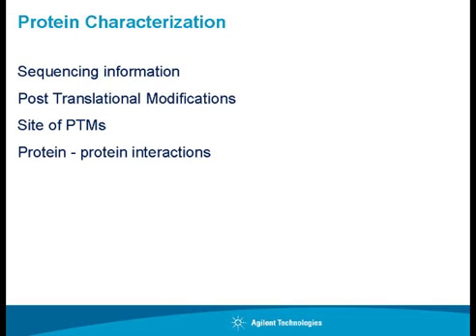The second step, characterization, is you sequence it, and you identify or characterize what the modifications are. The protein can be in native form, it can be in modified forms, and what are the sites where it is modified. That is the characterization, and then interactions, and then quantification, either absolute using iTRAQ sort of technology, or label free, differential.